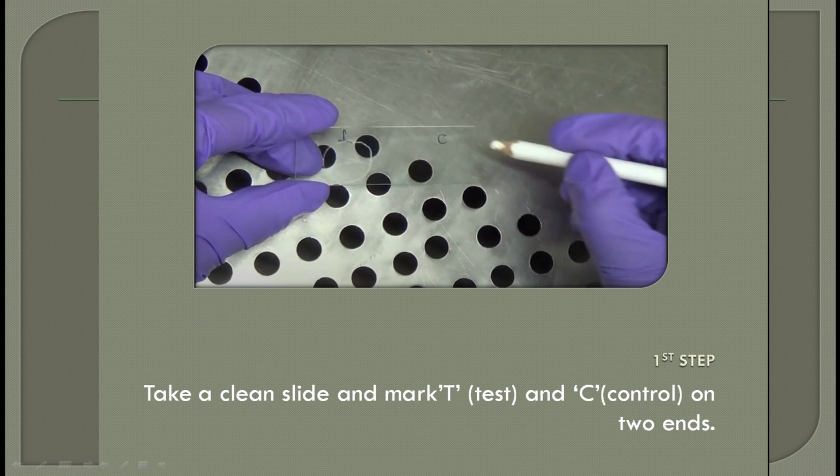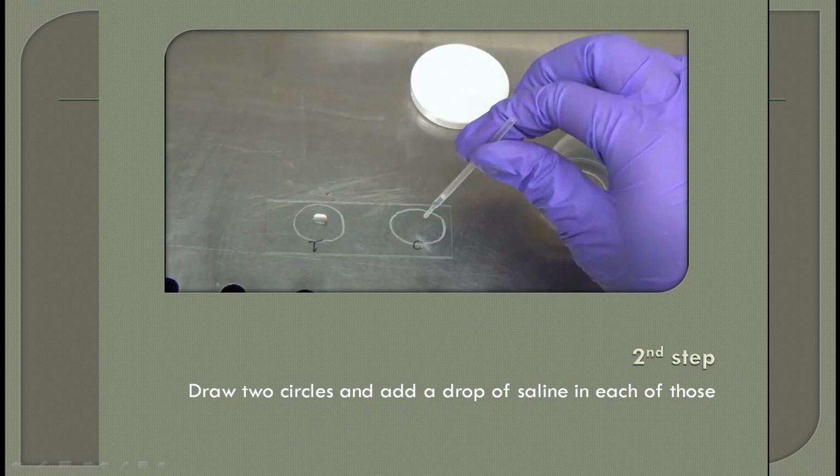Now we'll draw two circles on the T and the C mark, which will demarcate the boundaries within which the samples will be put, emulsified and everything will be done. After drawing the two circles, we will add one drop of saline in each of the T and the C circles.